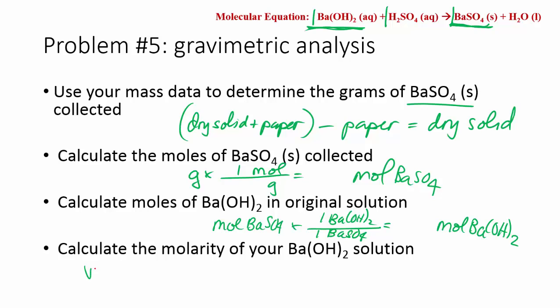You know the volume. Remember, the volume of your sample should be somewhere around 10 mL probably. Hopefully you wrote down exactly how much you used. And molarity is moles over liters. So you find your molarity of your barium hydroxide solution.